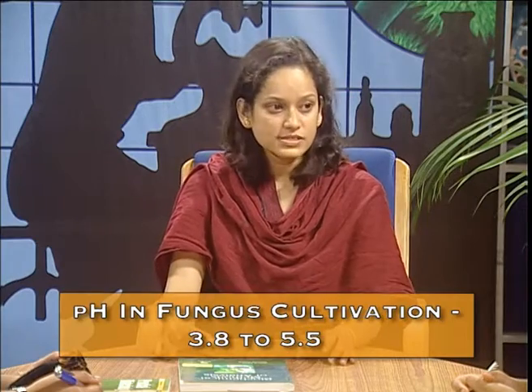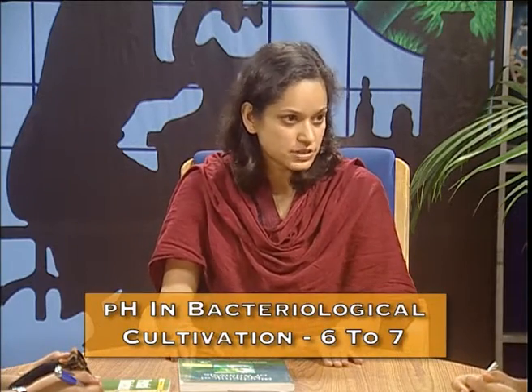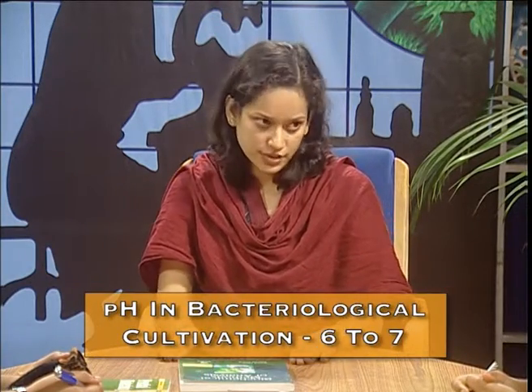Generally, the media used for fungal cultivation differs from bacterial cultivation in that the fungal medium contains a high concentration of sugar and the pH is very low in comparison to bacteriological medium. The pH used for fungus cultivation lies in the range of 3.8 to 5.5, while the pH used for bacteriological media is from 6 to 7.